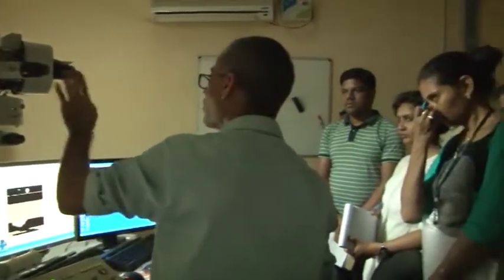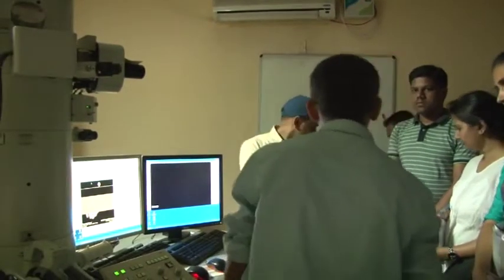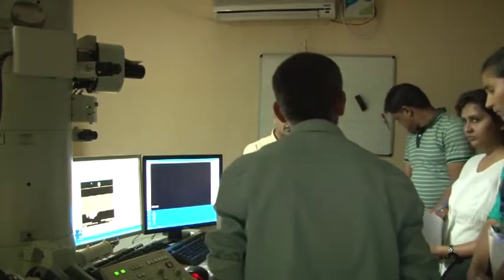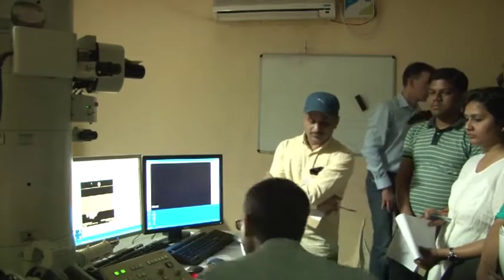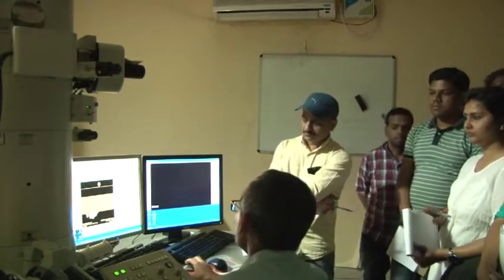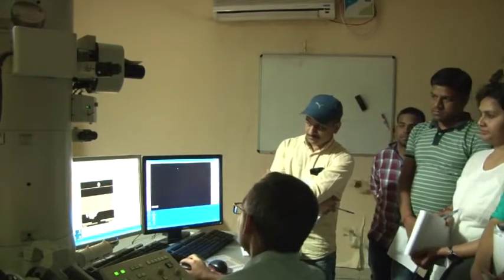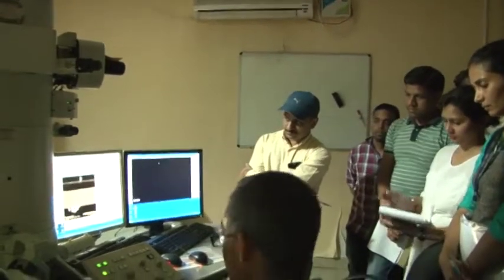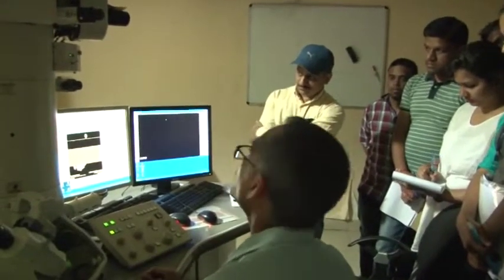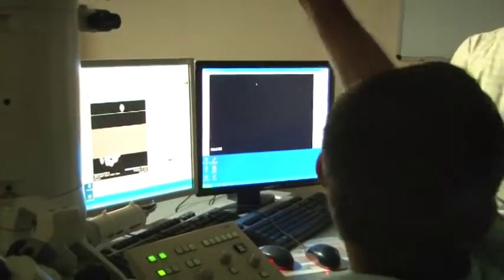But right now, I believe that this right hand pedal is exactly the one, but let us check. What we will do is keep looking at this point here. You see here TX. I will try to tilt it, and let us see if that value changes, and some of you can maybe try to see if one can feel whether this is rotating or not.